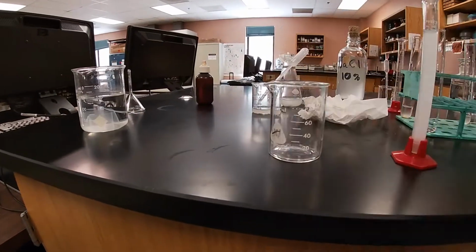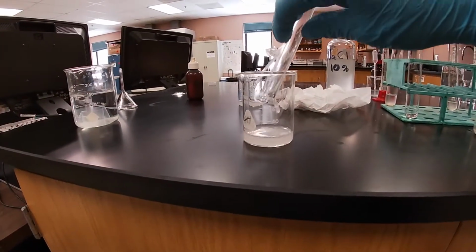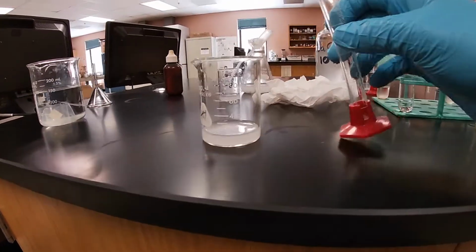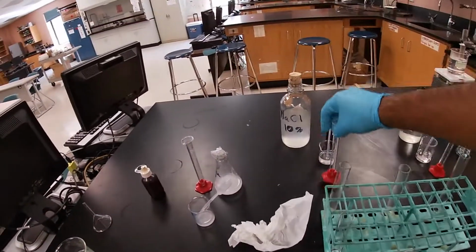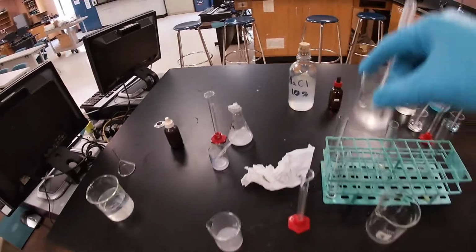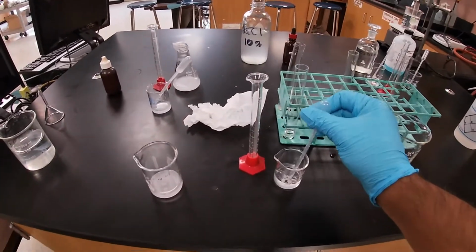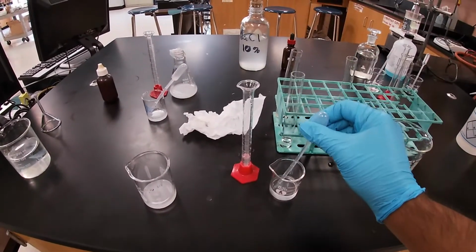We're going to get our beaker. We're going to go ahead and add our solution to our other beaker, where we're going to add the other solutions as well. So now the next thing that I'm going to do is get the other graduated cylinder, and then I'm going to measure out 10 milliliters of my sodium chloride solution. So I'm going to go ahead and start adding it.